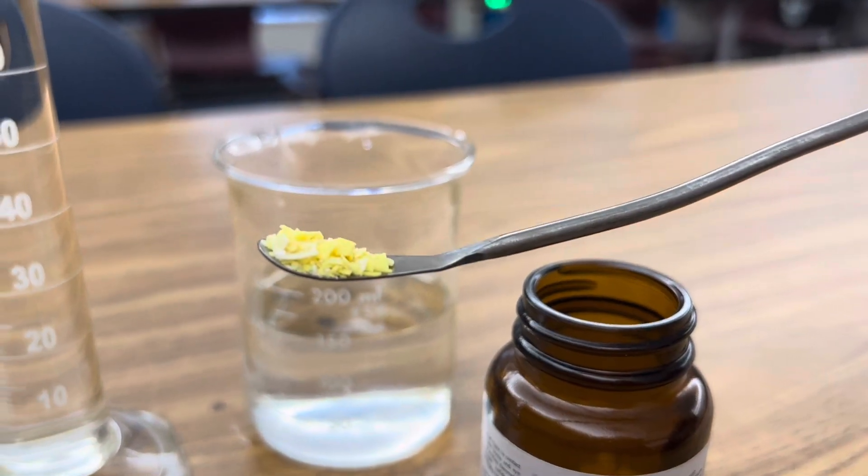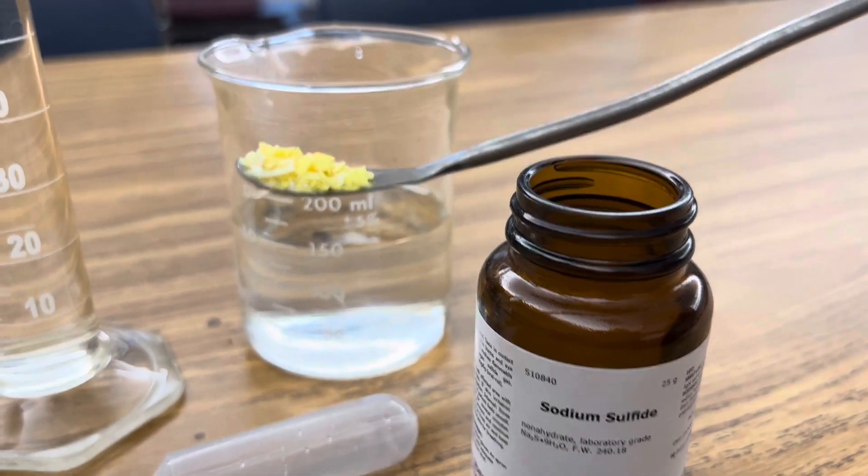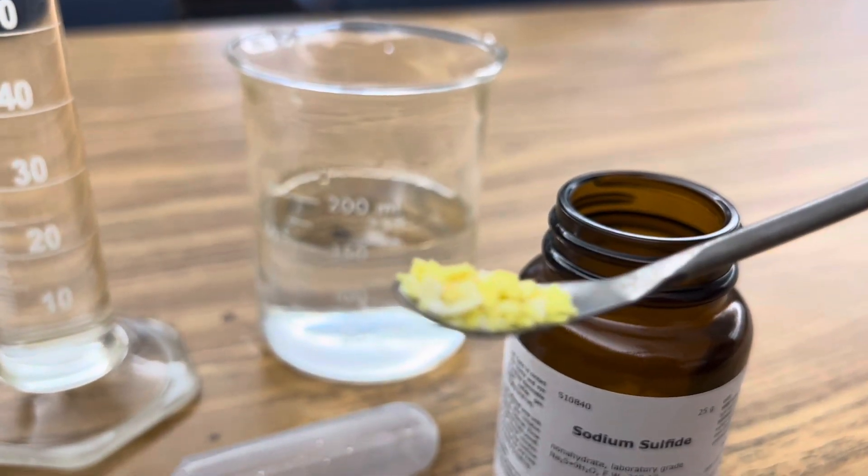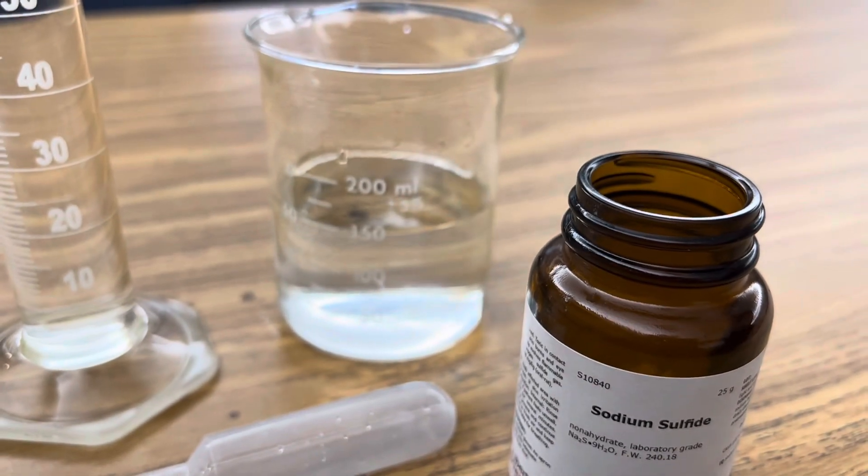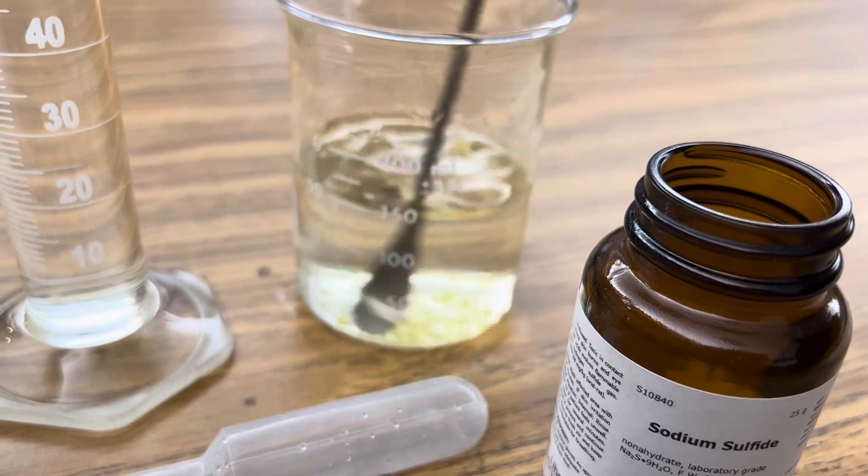Start by adding about four grams of sodium sulfide to 150 milliliters of distilled water. You'll see it's kind of a flaky white yellow compound. Stir that in until your solution is completely aqueous.